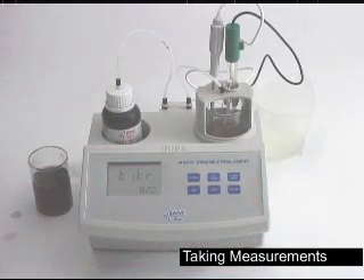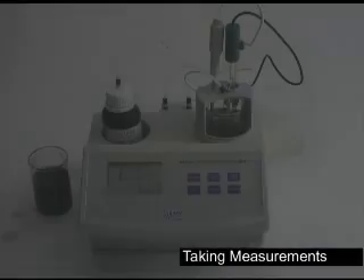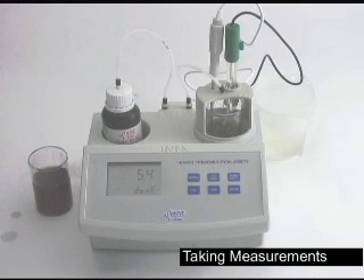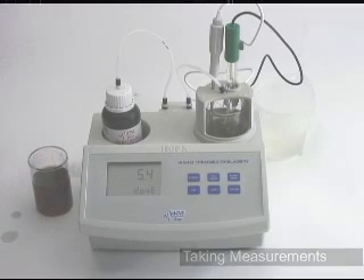Simply hit start. The titrator is going to titrate to a pH endpoint of 8.2 and then it will display the results across the screen in grams per liter. The machine is done and you can see the results — 5.4 grams per liter of total acidity for this wine. If you're used to grams per hundred milliliters, just move the decimal point one place — this would be 0.54. That's it for running a total acidity test on the HI84102 from Hanna Instruments.